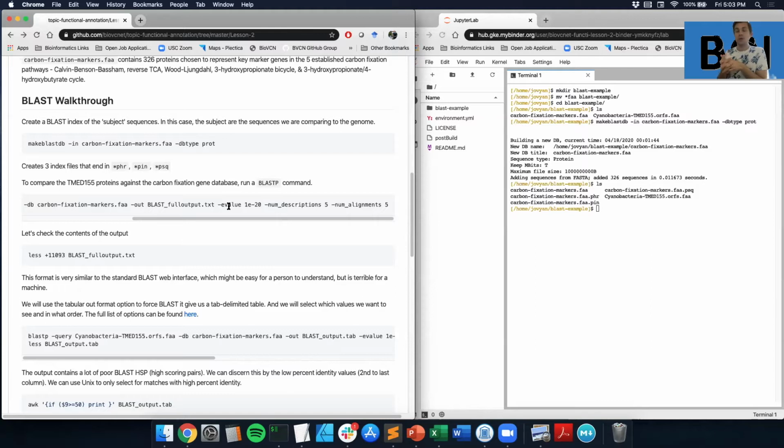you're comparing against. So if you're comparing against a really large database, it can be really hard sometimes for BLAST to find a significant match because there's just so much information that it's comparing against in that all versus all search. And so if you're comparing against a larger database, to consider something as a potential match, you might have a setting of 10 to the -3 or 10 to the -5.